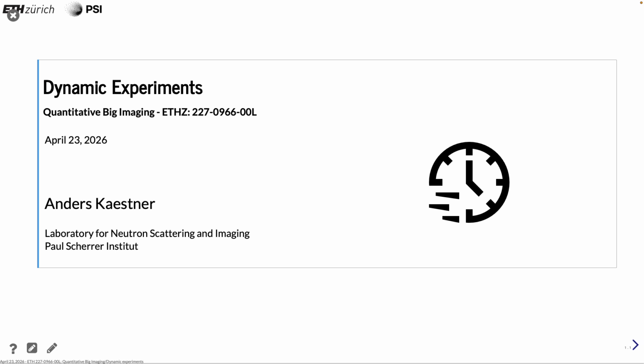So, not really real time, as we are going to talk a little bit about today. Today's lecture will be about dynamic experiments, and that is really a source of massive data if you don't watch out.